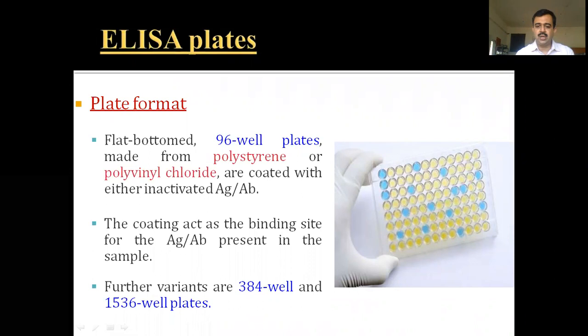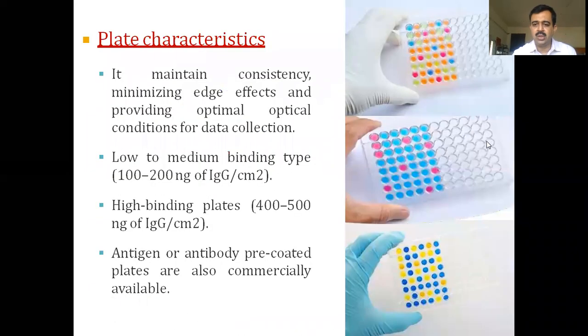Further variants of 384-well and 1536-well plates are also there. So the capacity of the well plates is very high, and you can easily go along with it.